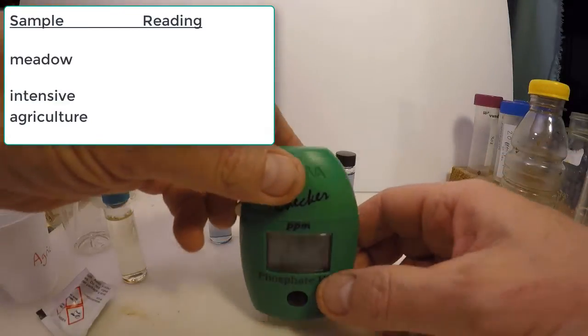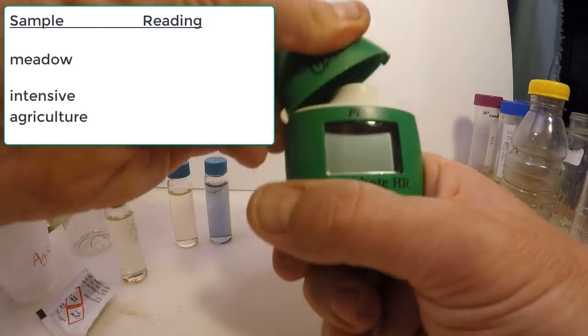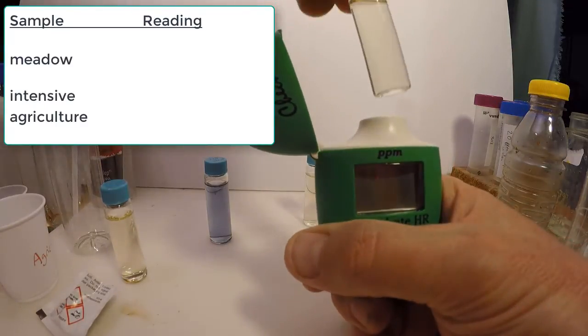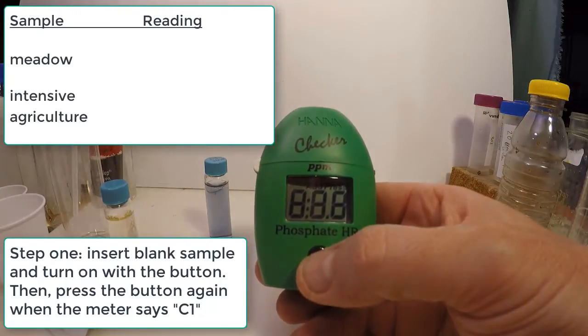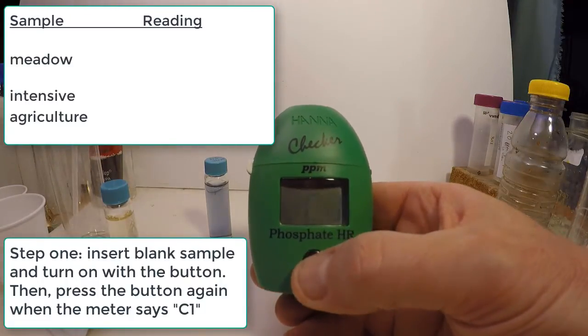Now we'll show how the colorimeter is used to measure the blue color of the solutions in the vials, and thereby how much phosphorus was originally in the soil.